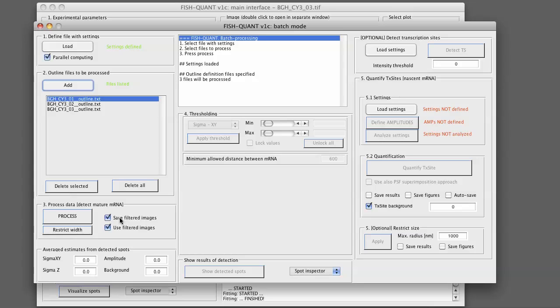You can also use filtered images. Here FishQuant will use default names that were specified for those images. If it sees that they are already present, it will automatically use them without going through the filtering step and will again generate outline files that will reference those files. To see what the default name is, please consult our help file.